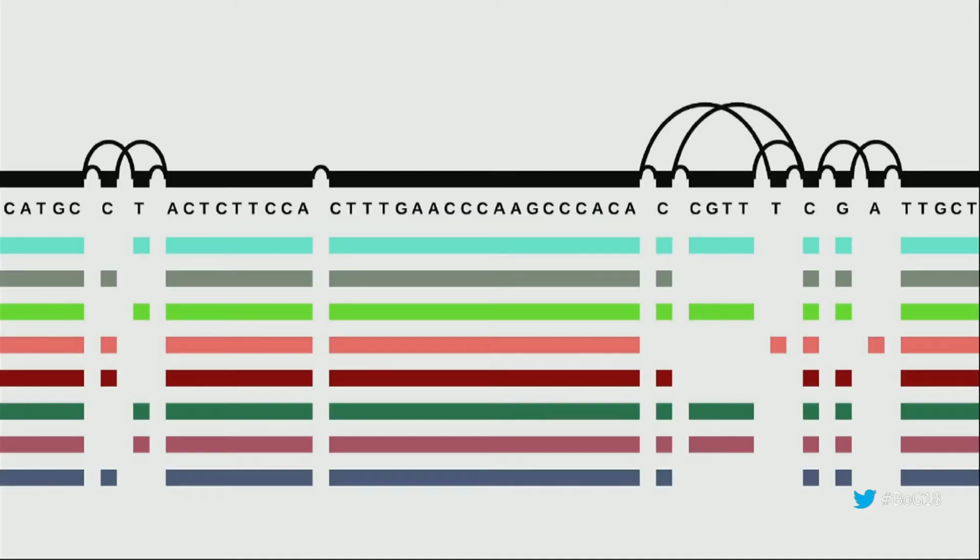And then there's another perspective which is very helpful in some analytical contexts, and it's kind of a monoallelic model. So every single base in the reference system is represented as a vector. And we can think about annotations or genomes against this as one-hot vectors or vectors of continuous values across the space. So in this case, the blue genome here would have this T in this SNP, and then it would contain this sequence that's part of an indel that's present or absent in different individuals.